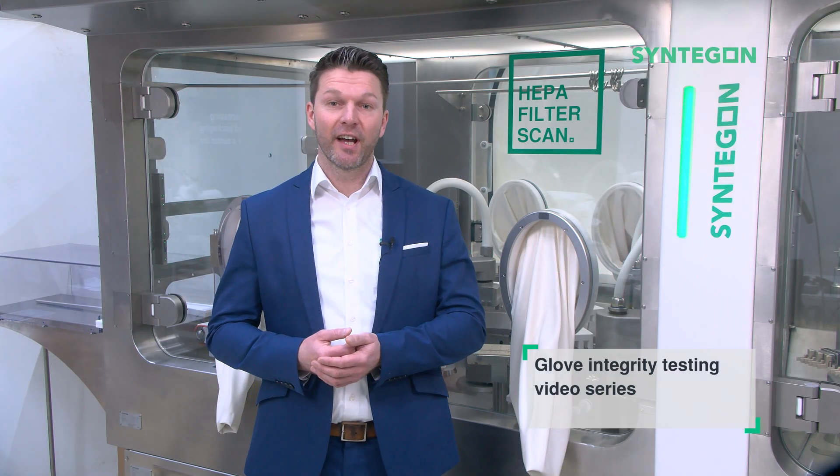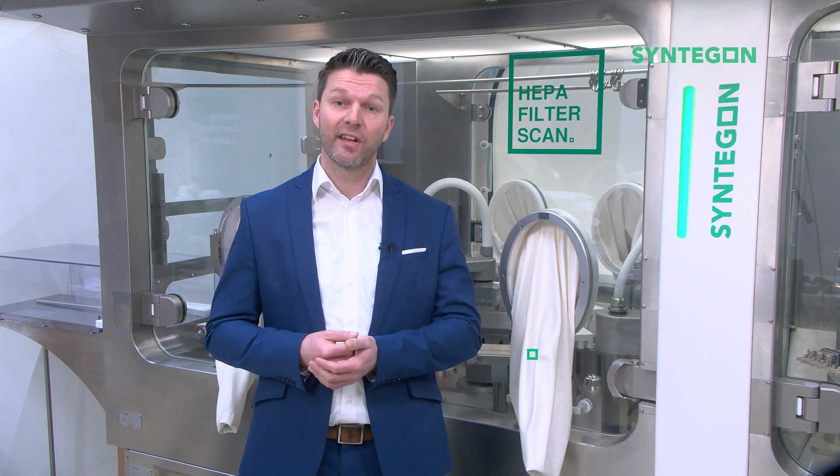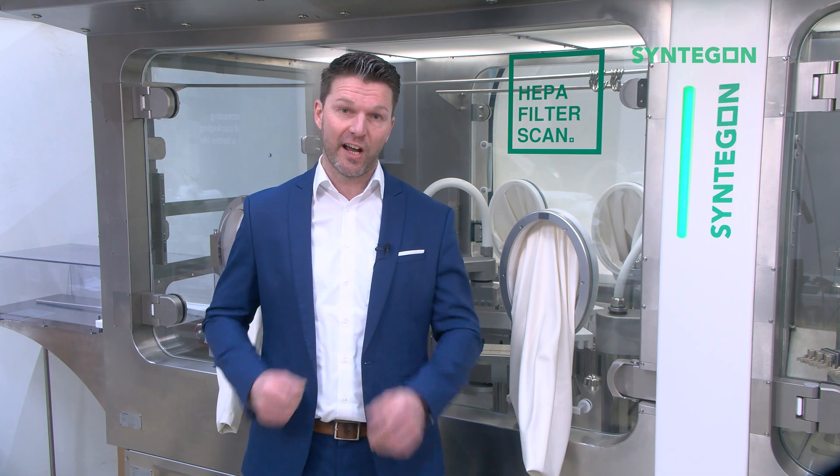Welcome to our Glove Integrity Testing video series. Part 2 of the series is about showing different possibilities for Glove Integrity Testing. Glove Integrity Testing is actually pretty simple, and Syntegon can support you in providing suitable equipment for the task.